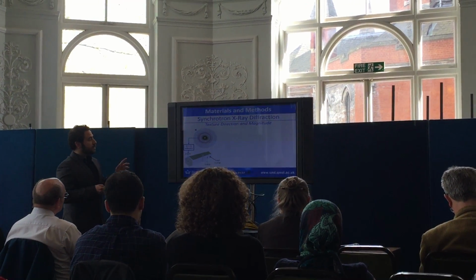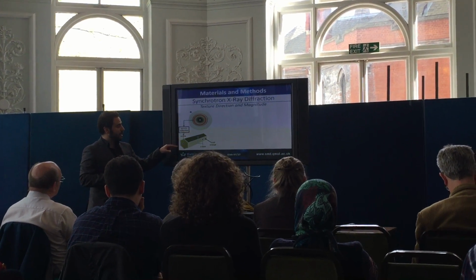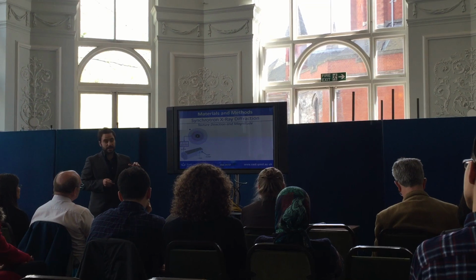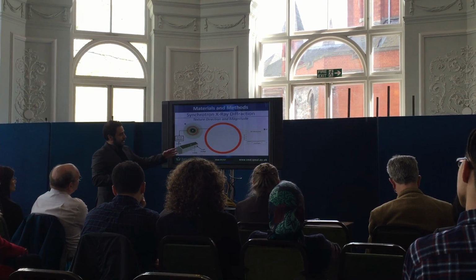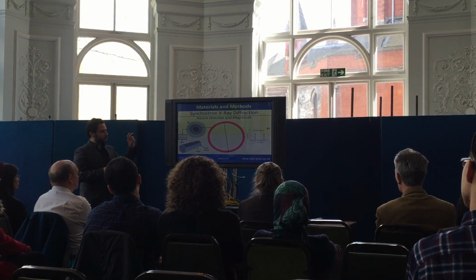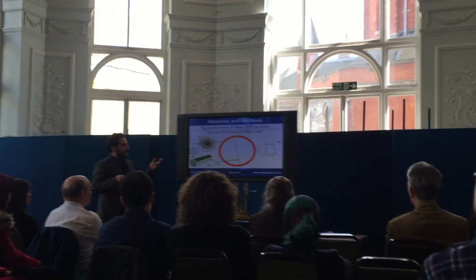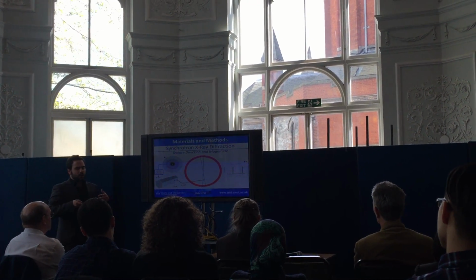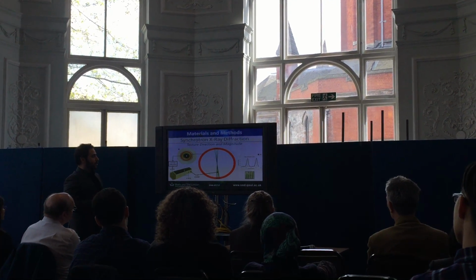How? Well, this reflection is related to the plane perpendicular to the long axis of the hydroxyapatite crystal. How, you might ask? Well, let's see. This is our reflection. It appears like this in a 002 reflection curve. If we have a single crystal, it will appear as 2 dots at either side. So here we go, we have the direction of our crystallites. If we have a second crystal, it will appear as 4 dots, 2 dots at each end. Now if we have a powder sample, like for example a tooth, an enamel, we will have something like this.